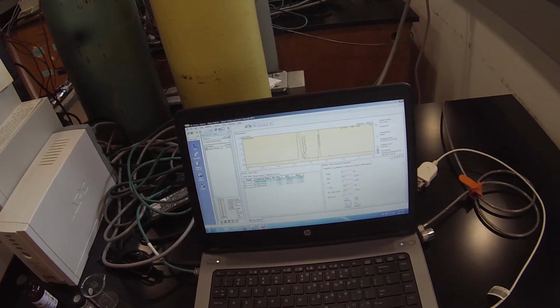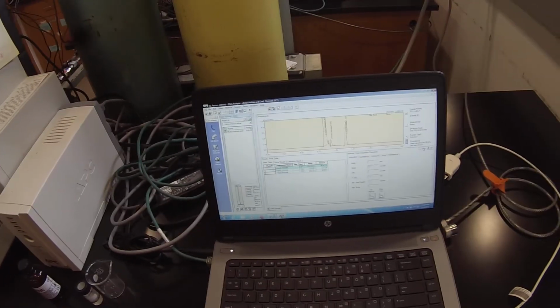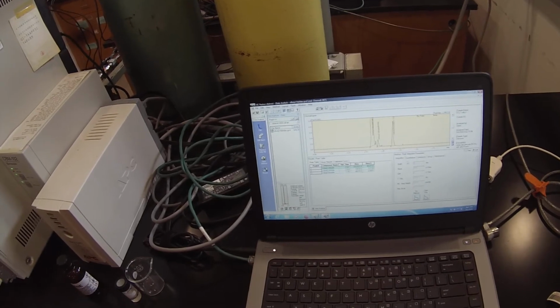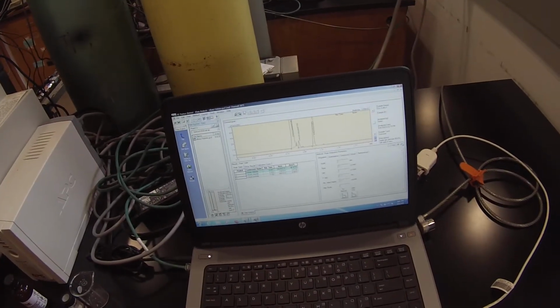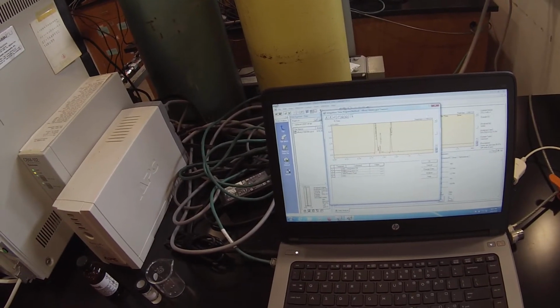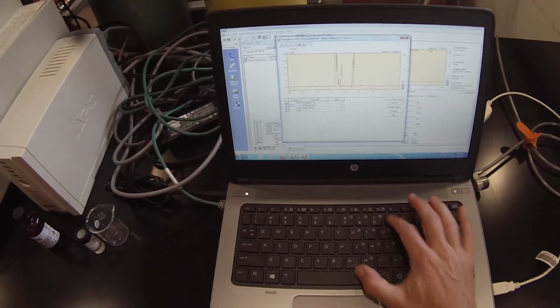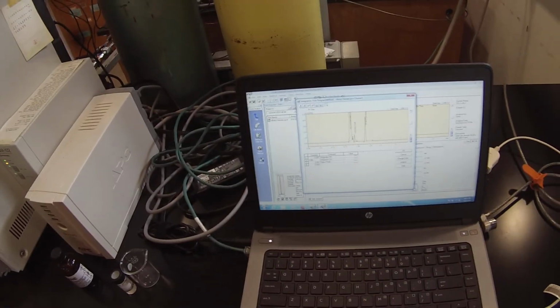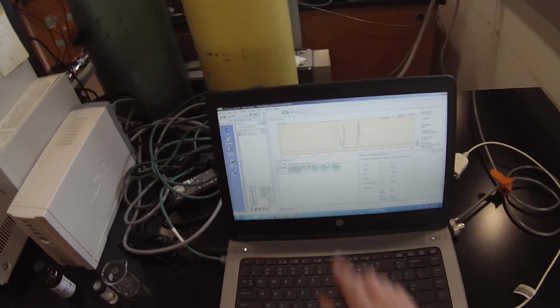And then when I go to view here, it looks like I need to maybe turn the integrator off, not turn the integrator on at all until about 0.86. And that should make those peaks go away.